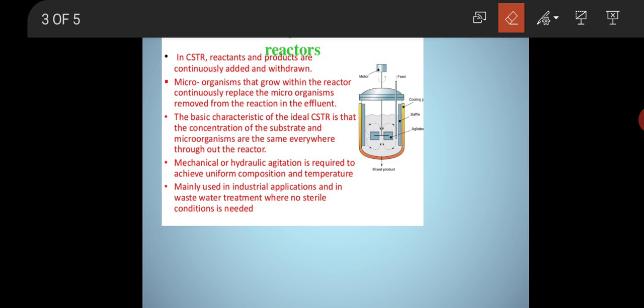This impeller consists of 2 or 6 blades. There are different types of impellers, like open turbine impeller, disc turbine impeller, radial impeller, etc. Let's talk about the open turbine impeller. Here the blades are the impeller, that is nothing but the blade.